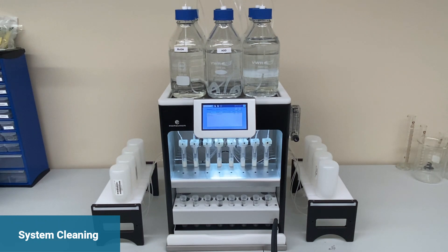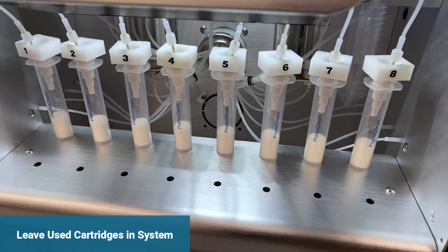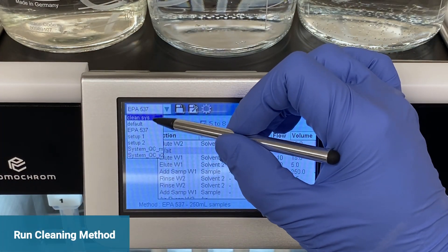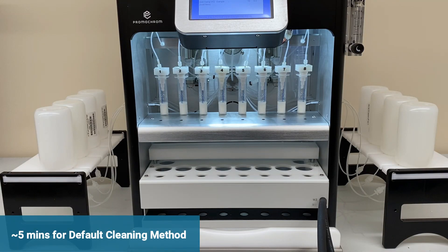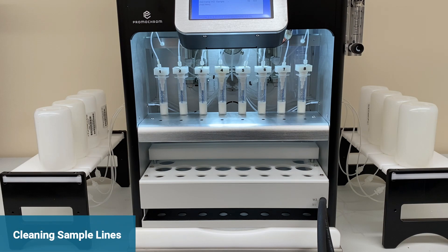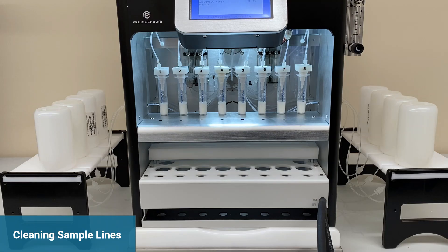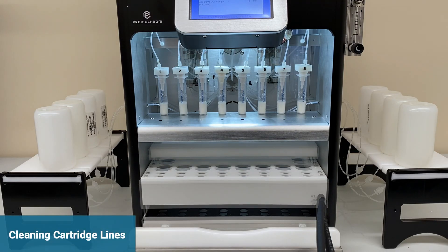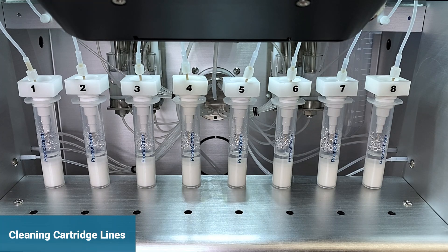Cleaning the SPE03 between sample batches is also fast and convenient. The used SPE cartridges can stay in the system during cleaning. Bring up your cleaning method and run it. The default cleaning method takes about five minutes. Cleaning solvent is first used to clean the sample lines and bottle adapter. The system then backdraws the solvent and pushes it through the cartridge lines. The bi-directional clean is more effective in removing carryover and is done twice in the default method.